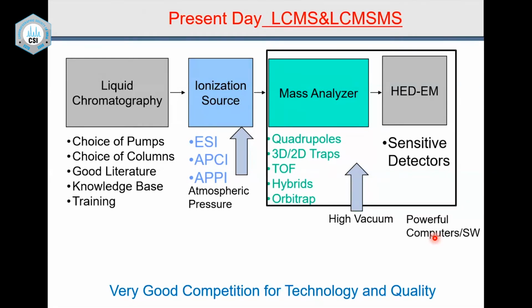Small molecules, you can deal with the GCMS or LCMS, but in the case of high molecular weight compounds such as proteins, peptides, etc., you cannot heat them. So the only way you can do it is by LCMS. The advantage of LCMS is also that LC is a very versatile instrument, and you can have different column selections. There are hundreds of column selections today in terms of the stationary phase, and in terms of the amount of liquid mobile phase you want to use.